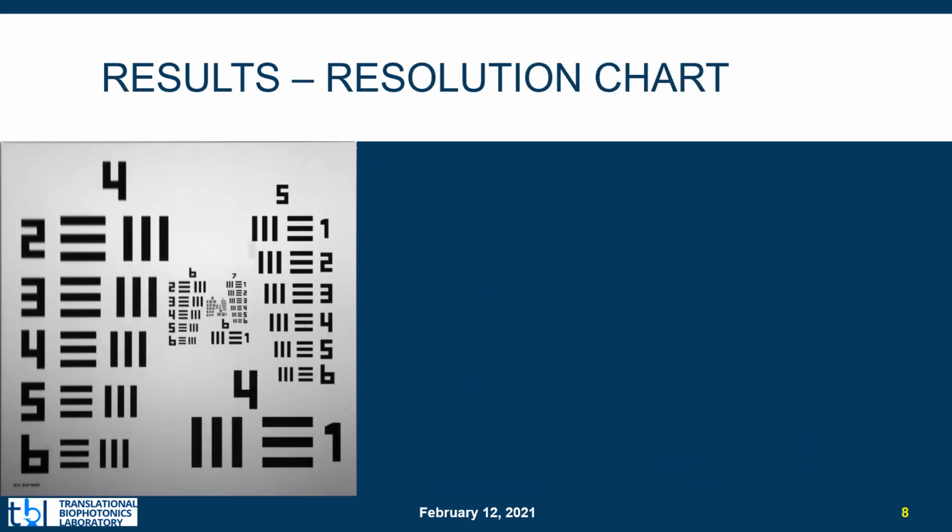First, we will quantify the resolution improvement of optical sectioning super-resolution structured illumination microscopy. For this purpose, we image a Ready Optics 2015A USAF target that can quantify resolution up to 137 nanometers. We placed a thin layer of acridine orange on top of the resolution target and used the system setup from the previous slide with 470 nanometers excitation.